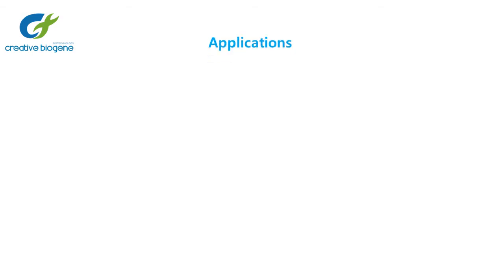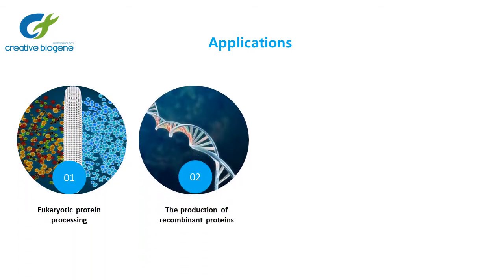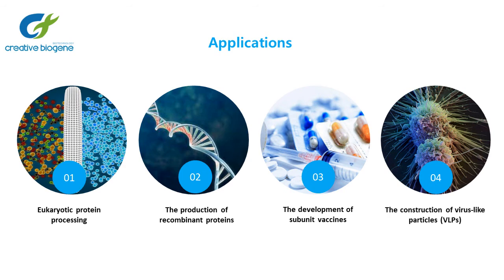The baculovirus expression system can be used for eukaryotic protein processing, production of recombinant proteins, the development of subunit vaccines, and the construction of virus-like particles, VLPs.